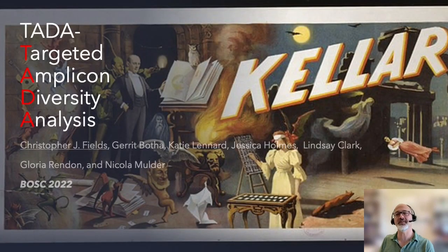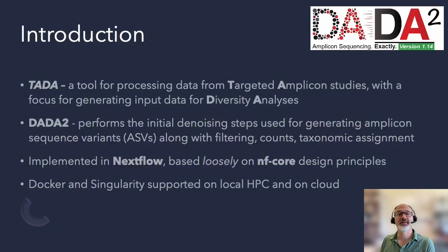I'm going to present a little short video for the poster that we're having at BOSC 2022 on TADA, the Targeted Amplicon Diversity Analysis Workflow. Quick introduction, TADA is a tool for processing data for targeted amplicon studies. It's a focus for generalizing input for diversity analyses. We work with a number of different types of data using this workflow, including 16S, of course, ITS, cytochrome oxidase, or COI, and a number of custom amplicons.